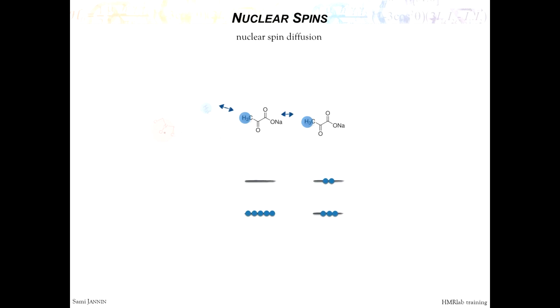If you look at the dipolar Hamiltonian, it leads to a spontaneous transfer of polarization between the spins. And so if you write, for example, a 4 energy level diagram with 2 spins, you see that there are 2 energy levels that are equivalent in energy. And so the spins can freely go from one energy level to the other. These levels are just spin up-down and down-up. So it's just an exchange of polarization between the spins, like on the line that I drew before. So this is going on spontaneously and pretty fast.